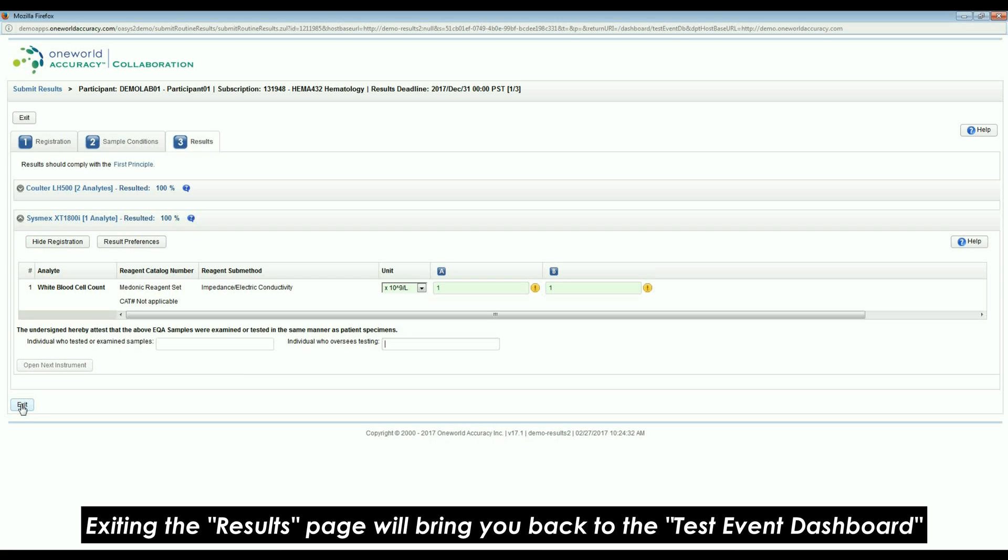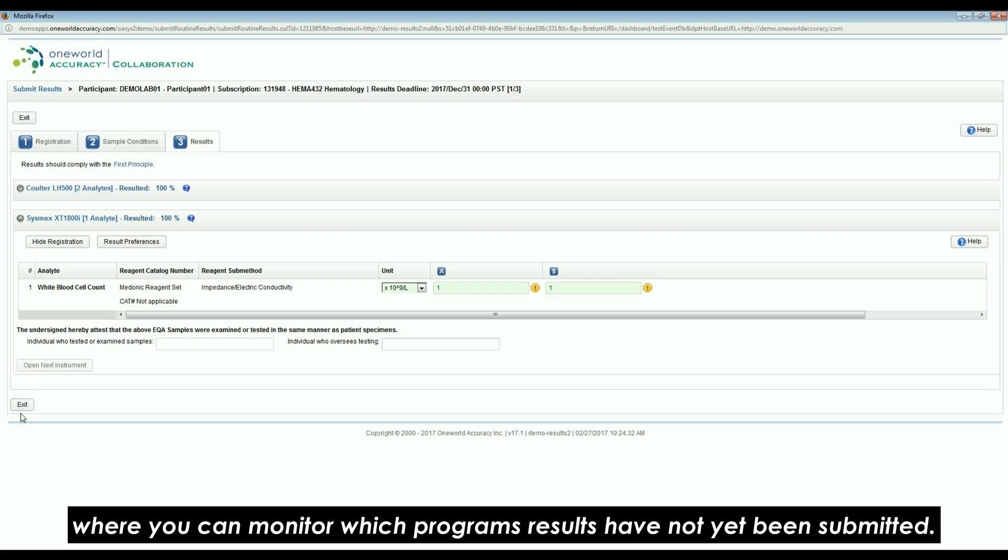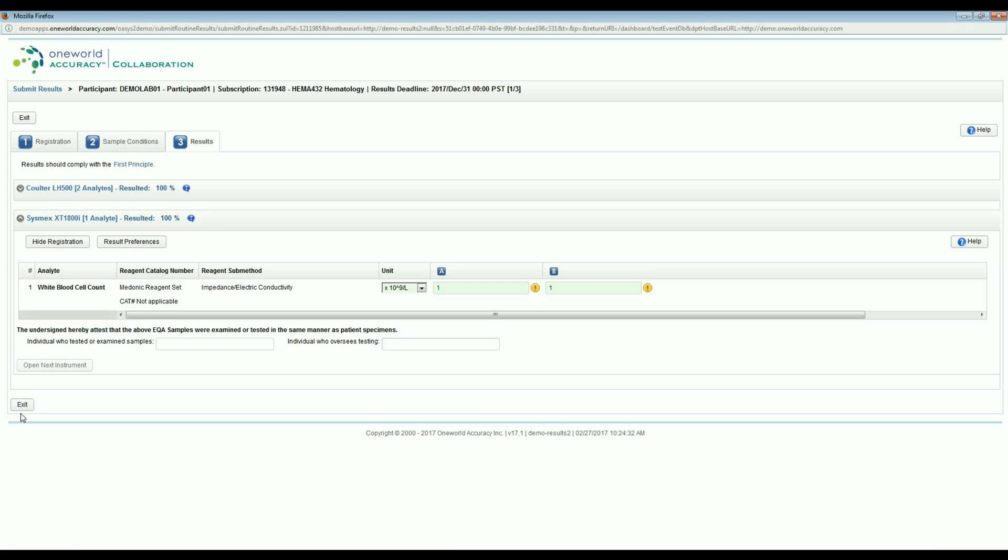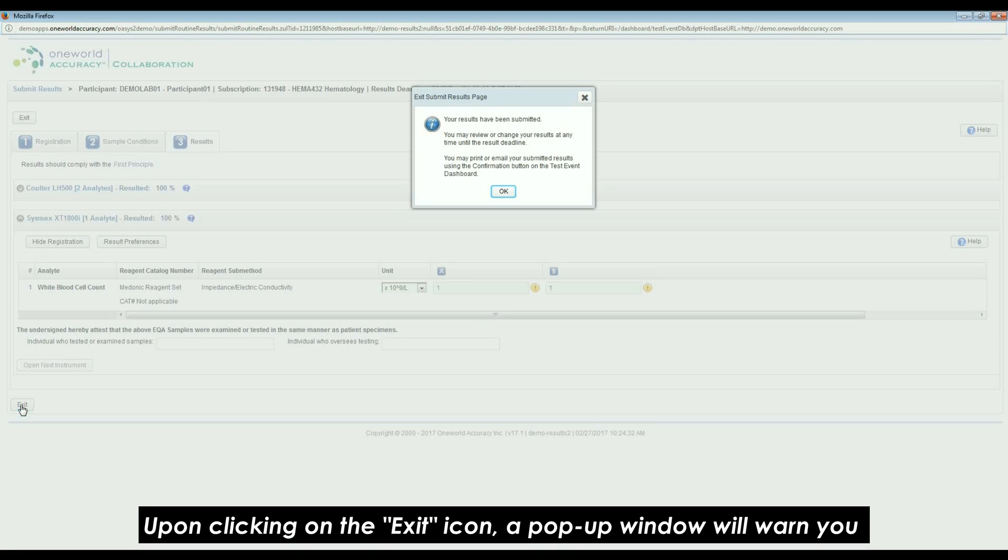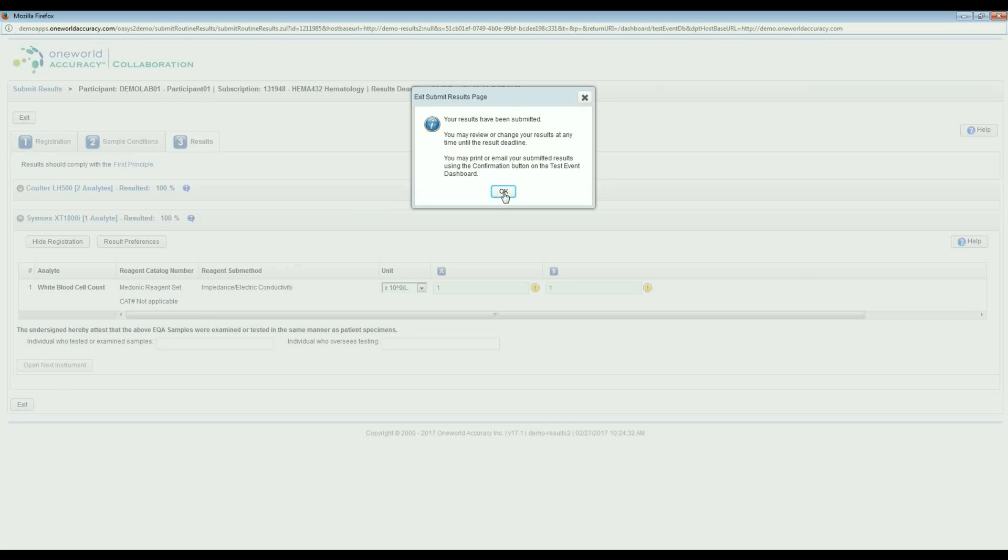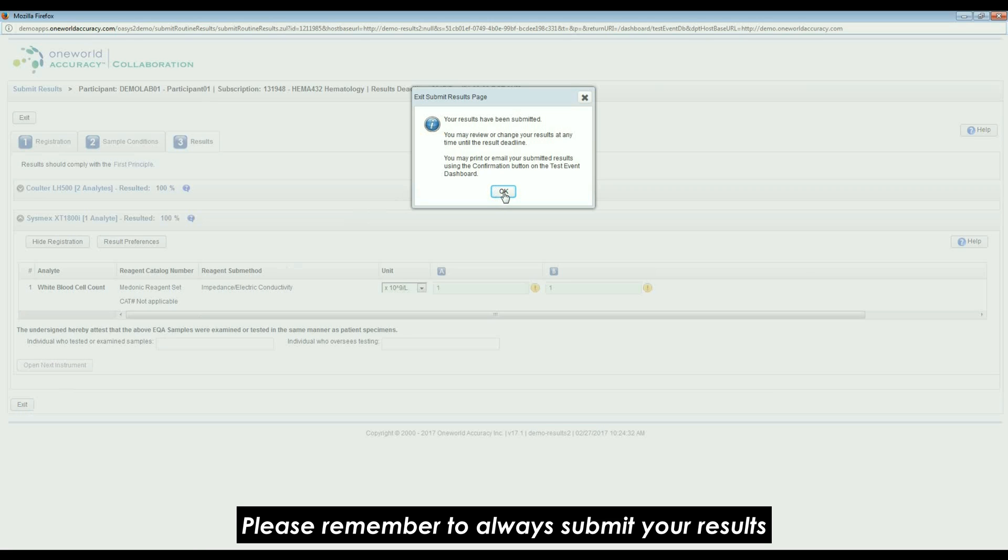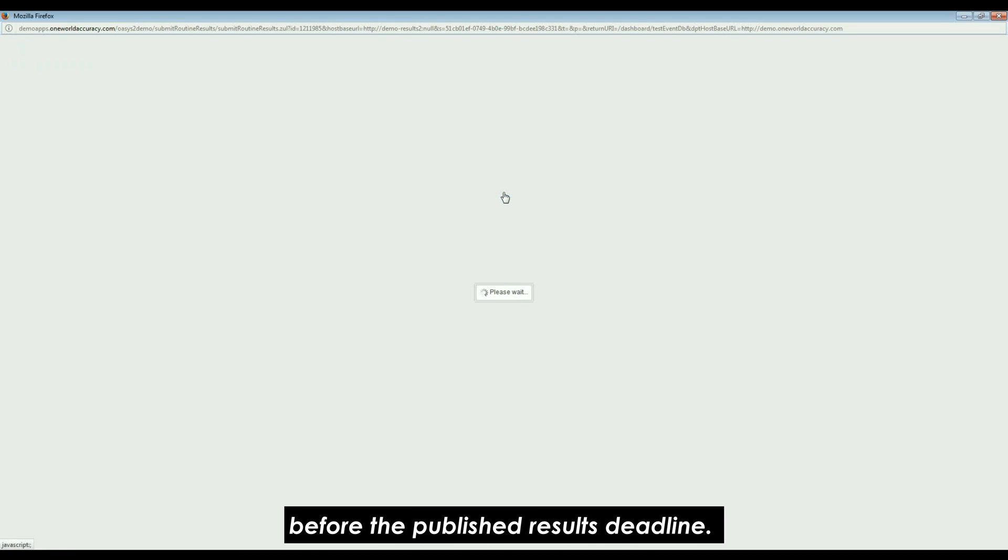Exiting the results page will bring you back to the test event dashboard, where you can monitor which program results have not yet been submitted. Upon clicking on the exit icon, a pop-up window will warn you if results are still missing for some mandatory analytes. Please remember to always submit your results before the published results deadline.